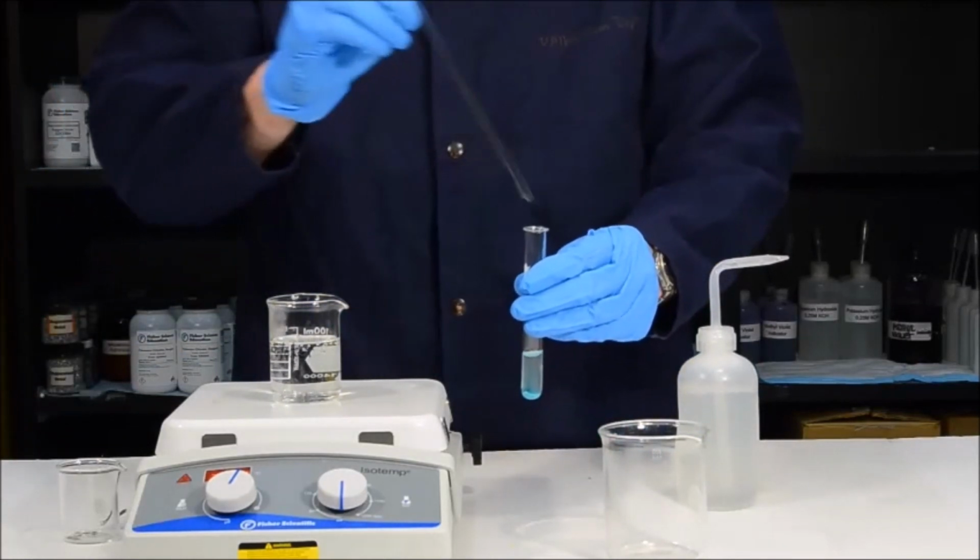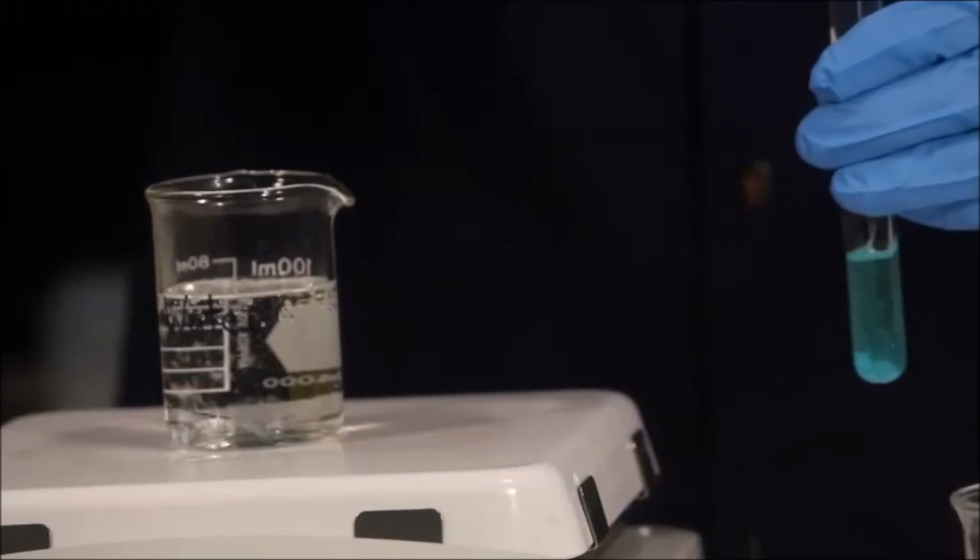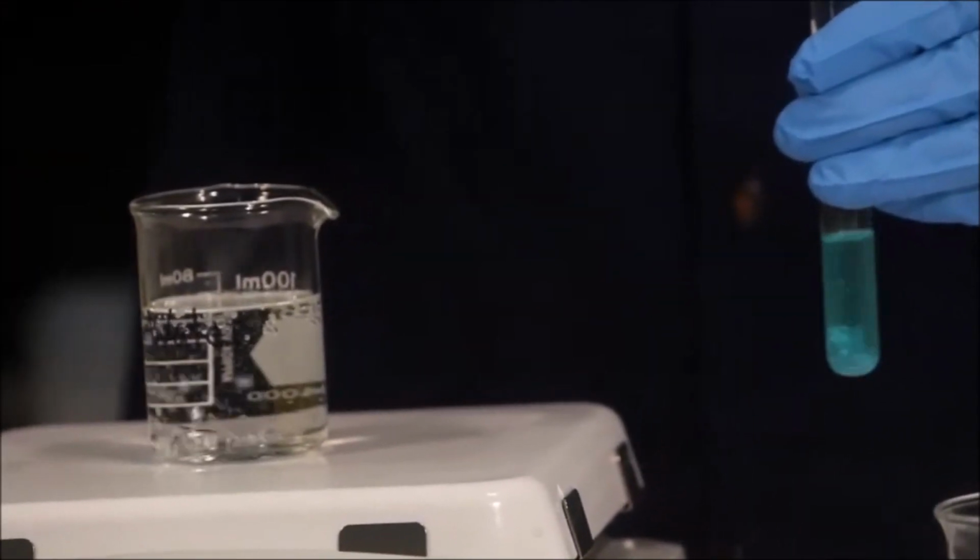You'll notice that the solution instantly turns blue as the copper 2 sulfate is rehydrated. You then want to use a stirring rod to gently swirl the solution until all of the copper 2 sulfate dissolves.